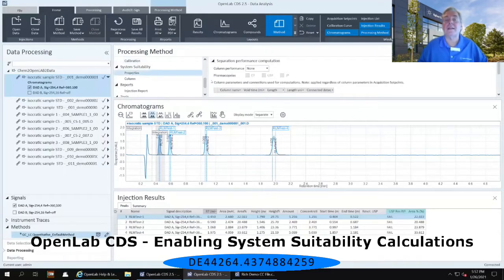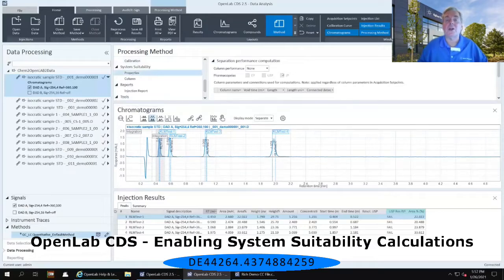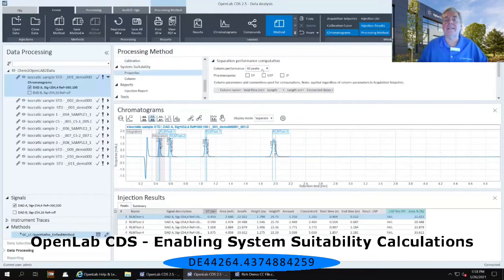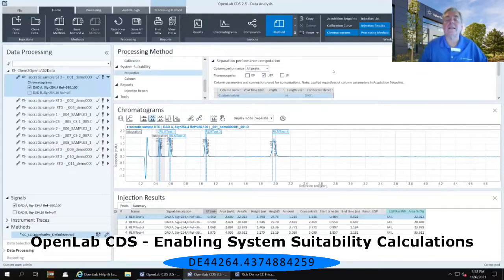And then to the right, you now have Separation Performance Computation. Currently, the column performance is set to None. Select that pull-down menu and set it to All Peaks instead of None, and select it to USP. Just click that checkbox immediately to the left of USP. You'll notice that a row is filled out in the column parameters down below, so we need to fill out some other information here.